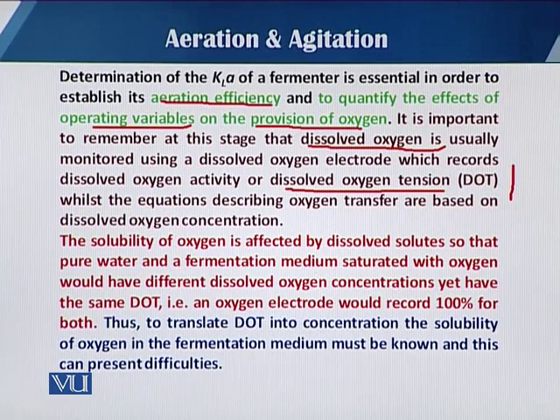If we describe the oxygen transfer based upon the dissolved oxygen concentration, the OTR and DOT are very interlinked.